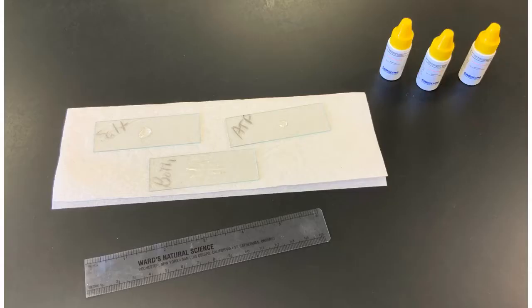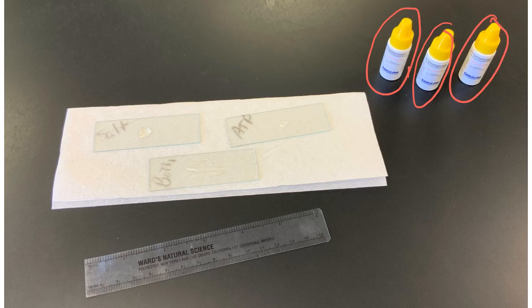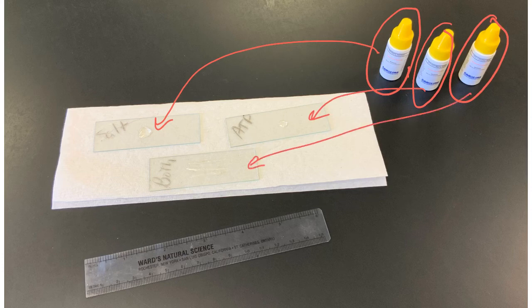So here you can see I've got my 3 slides. You really can't see the muscle fibers on it because they are so white, but the slides kind of fade when I put it in the black lab table. But over here you can see I've got 3 different solutions: salts, ATP, and both. And so I would have put the salt solution, I would have put a drop on there, ATP on the drop, both on there. Now I would have done it separate to allow for someone to measure. So you would have got 3 initial lengths.